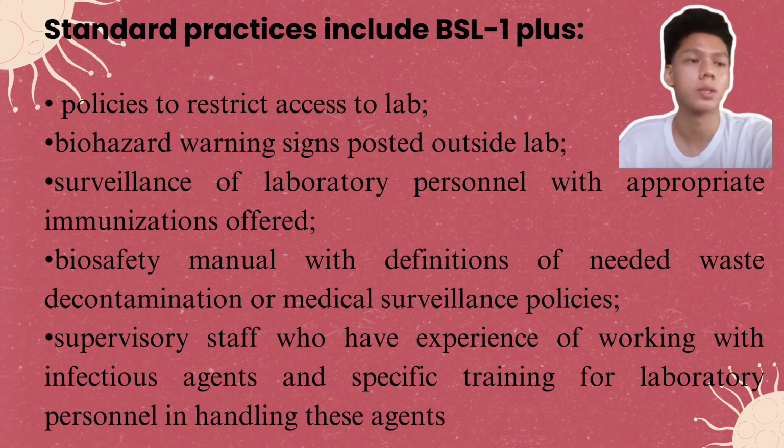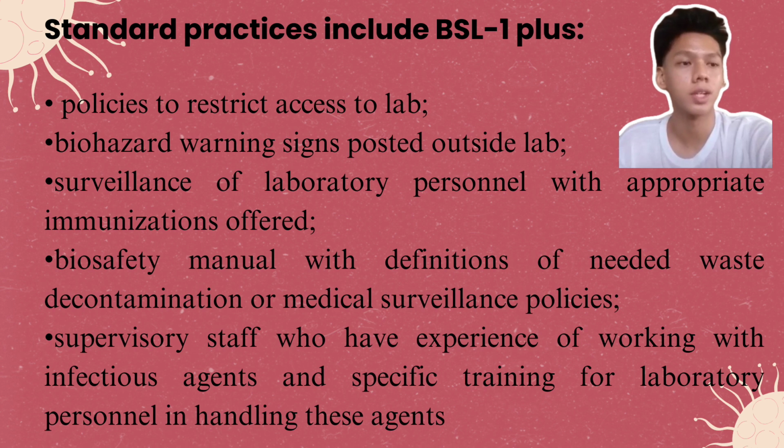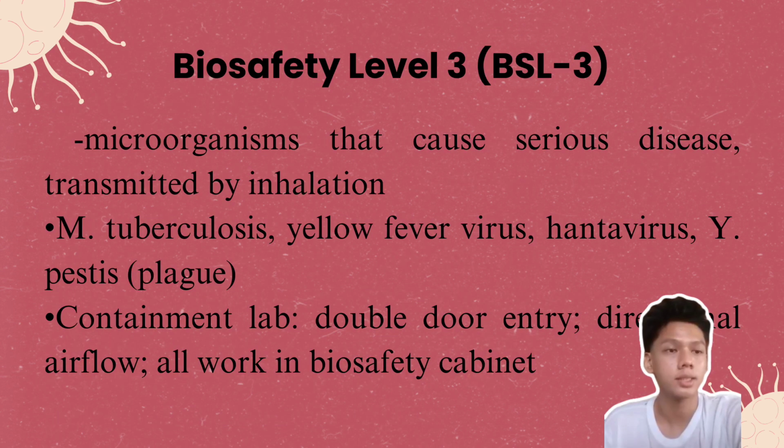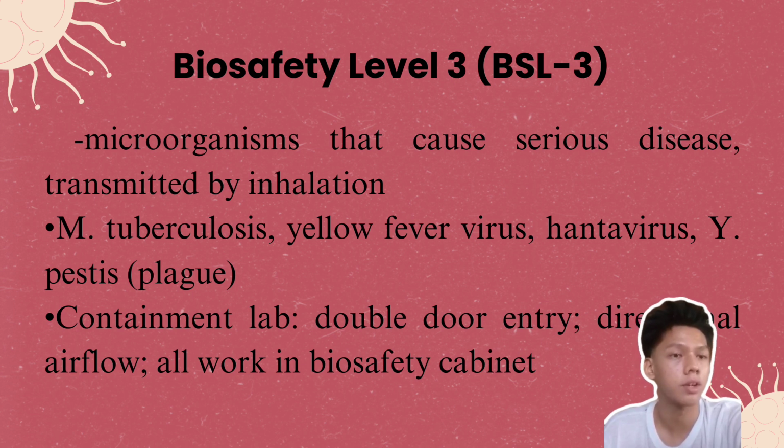of laboratory personnel with appropriate immunization offered, a biosafety manual with definitions of needed waste decontamination or medical surveillance policies, supervisory staff who have experience of working with infectious agents, and specific training of laboratory personnel in handling these agents. Next is Biosafety Level 3, BSL 3: microorganisms that cause serious disease transmitted by inhalation, such as tuberculosis, yellow fever virus, hantavirus, Y. pestis or plague. Containment lab, double door entry, directional airflow, all work in a biosafety cabinet.